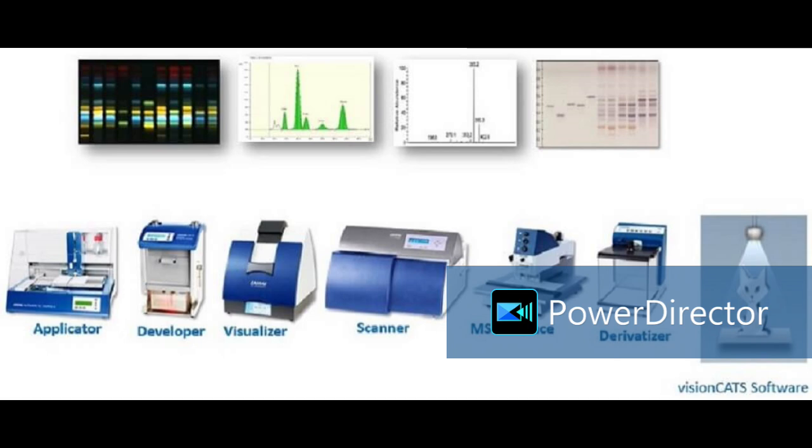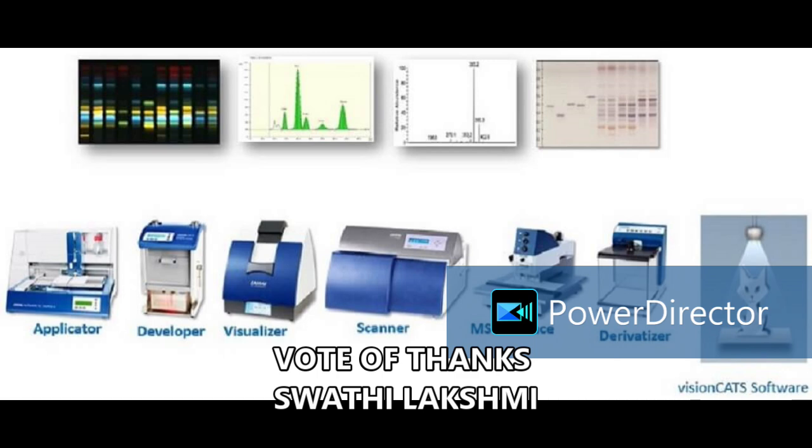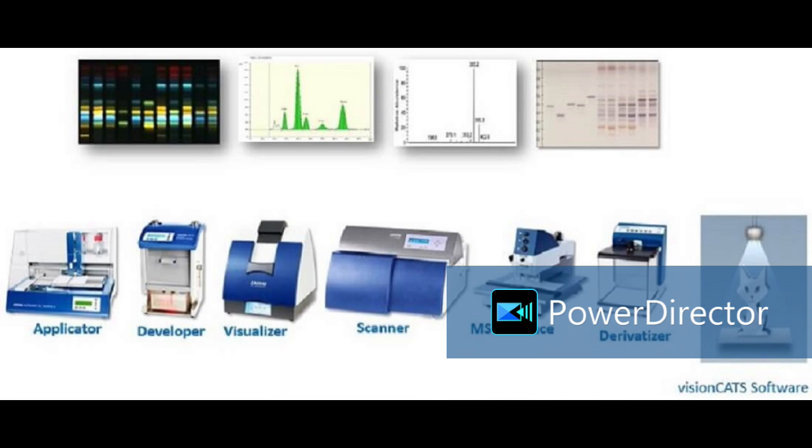With this, again there is one chart. There they have mentioned that if you are using a particular reagent, what should be the nozzle that you should be using or at which spray level. So you can see there are 6 different spray levels. According to this chart you follow, which nozzle will I use and at which speed will I spray. This is the hood.